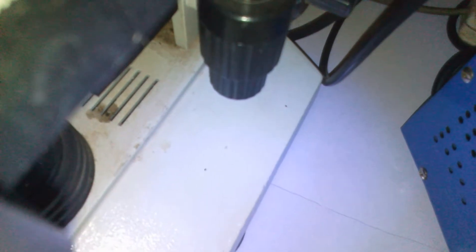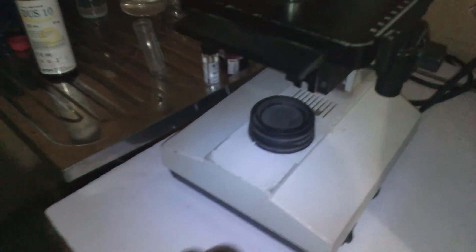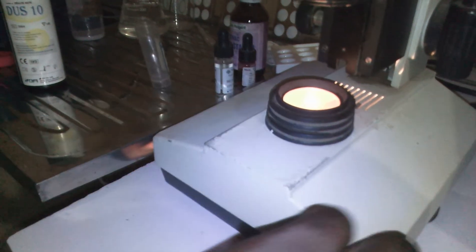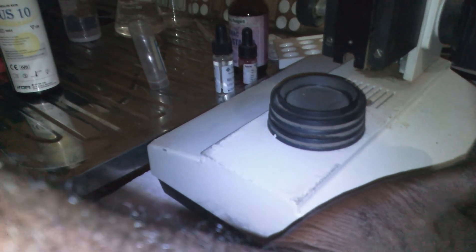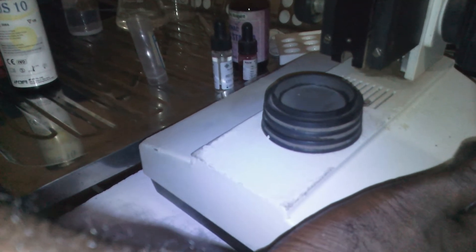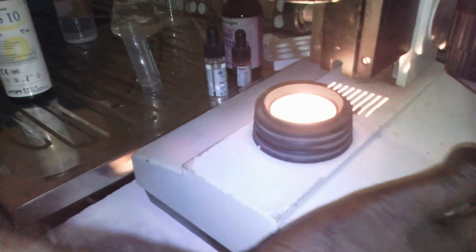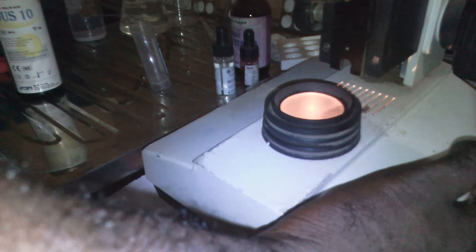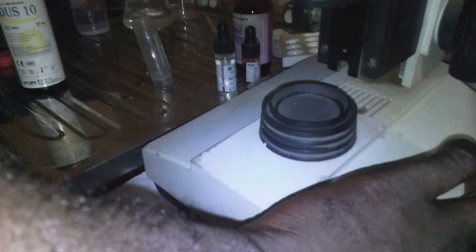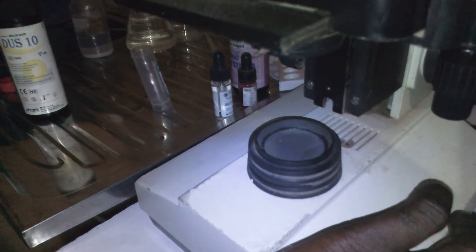This is where you switch on the microscope. You can see it here. Now you can see the light is on. This is used to regulate the light intensity. You can see it go up and it goes down.